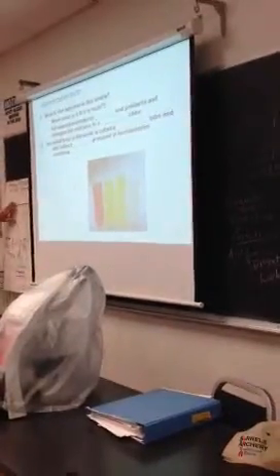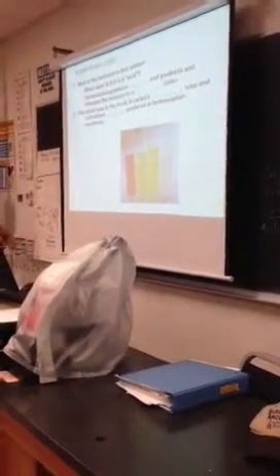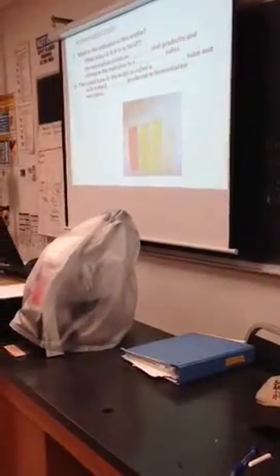We'll talk about that today. When we get into lecture, we're going to go through glycolysis again. I want to show you fermentation. And fermentation sometimes produces CO2 gas. And that's what's being collected in this.